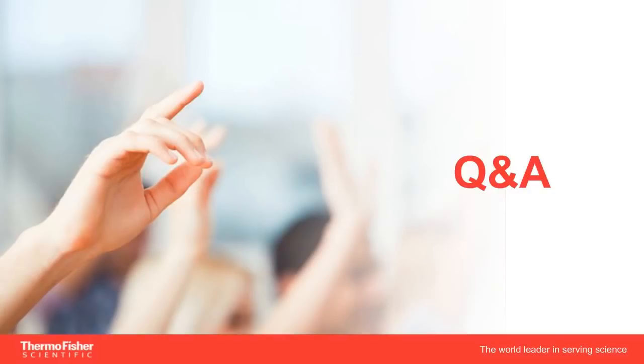Thank you. It looks like we have time for one more question. Would you recommend using a more neutral pH buffer like Bis-Tris for running a native gel with basic proteins to get better migration?